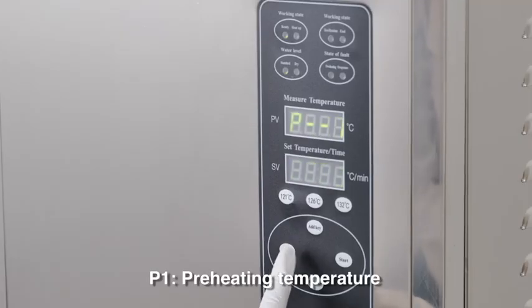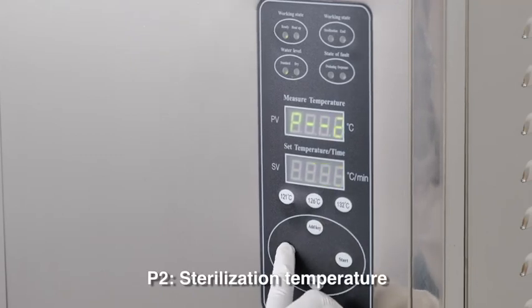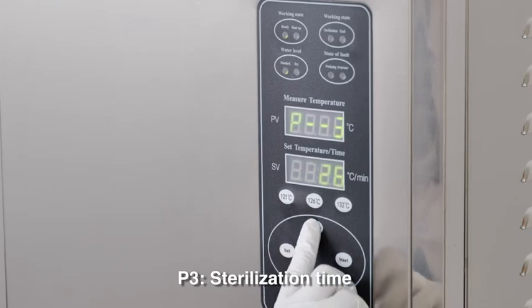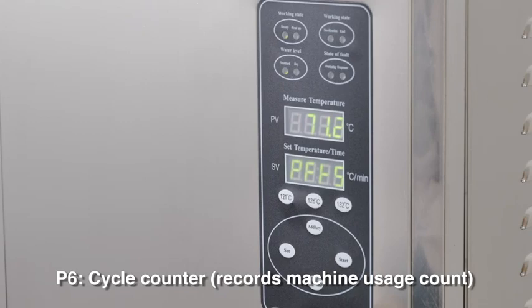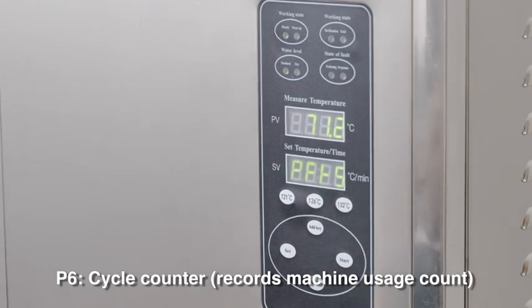P1 is preheating temperature, P2 is sterilization temperature, P3 is sterilization time, and P6 is cycle code to recall the machine usage codes.